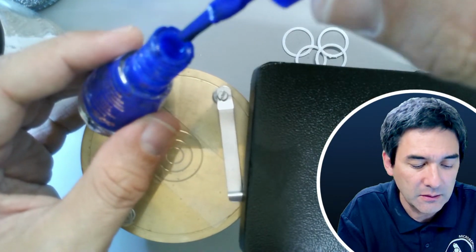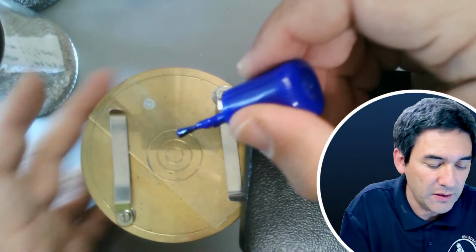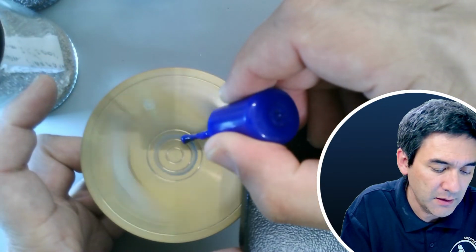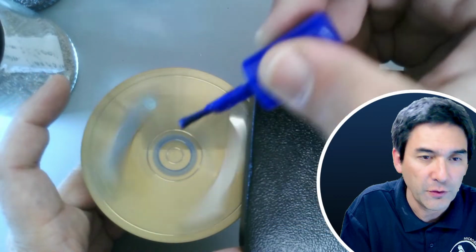Okay, and look, it's not going to look very nice. It's going to be very thick, but people who have a lot of experience with this are able to get quite nice results. So the first layer is completed.